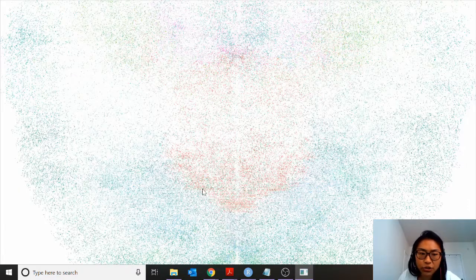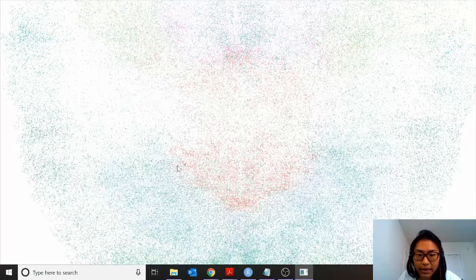Each cell has been given a Z position based on which image in your data set it has been placed as. So each cell has a centroid most point. The Z image, or the Z number of the centroid most point, is where that cell has been placed.